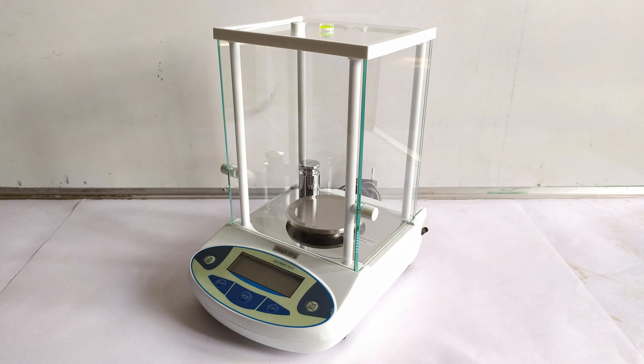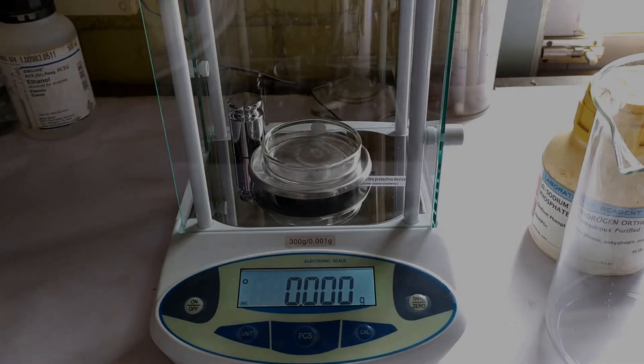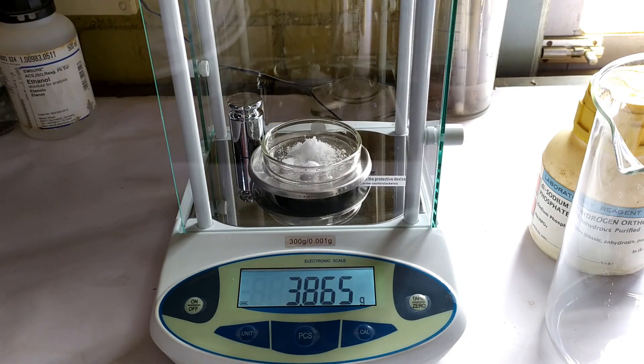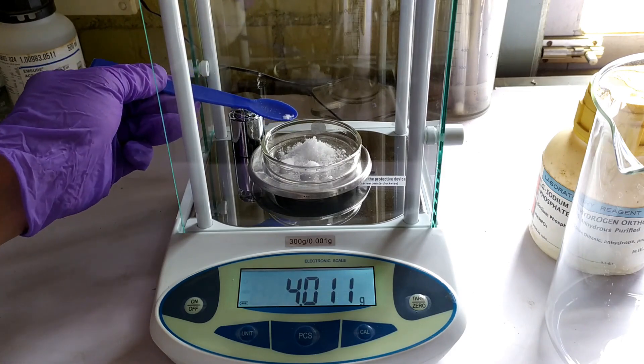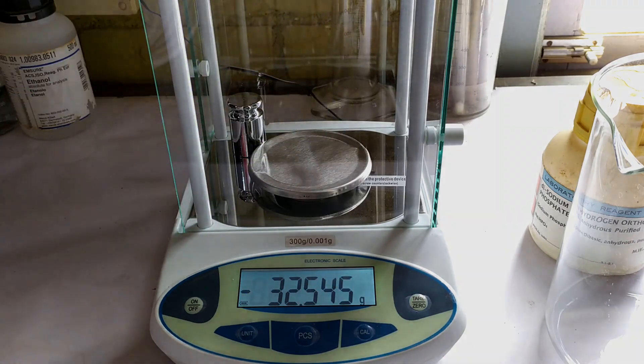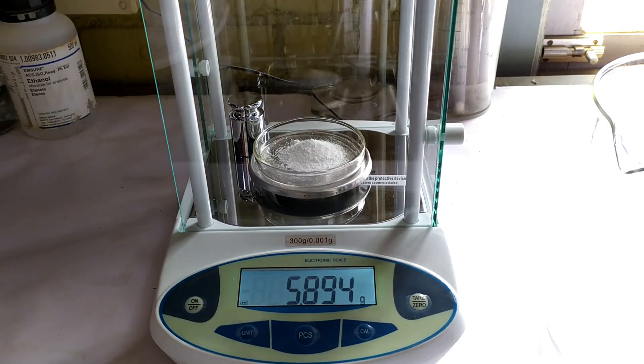You'll also need an airtight or plastic container for storing the prepared NBF, and a weighing scale accurate to at least 1 gram. To begin preparing 1 liter of 10% NBF, weigh 4 grams of monobasic sodium or potassium phosphate, followed by 6.5 grams of dibasic sodium or potassium phosphate using the weighing scale.